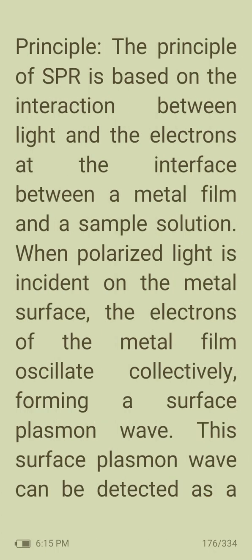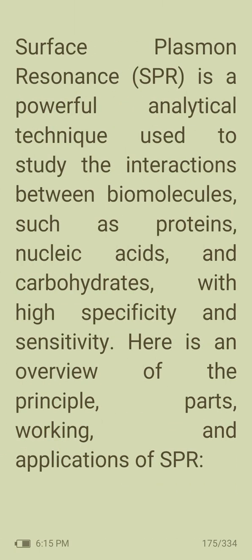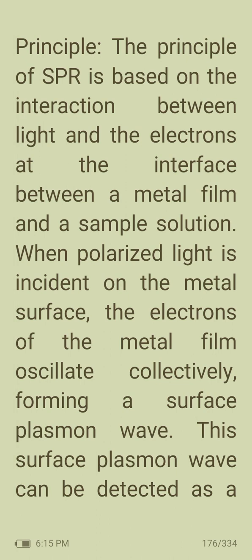So how is this done, and what is the principle behind it? The principle of surface plasmon resonance is based on the interaction between light and the electrons at the interface between a metal film and a sample solution. So what is happening here?